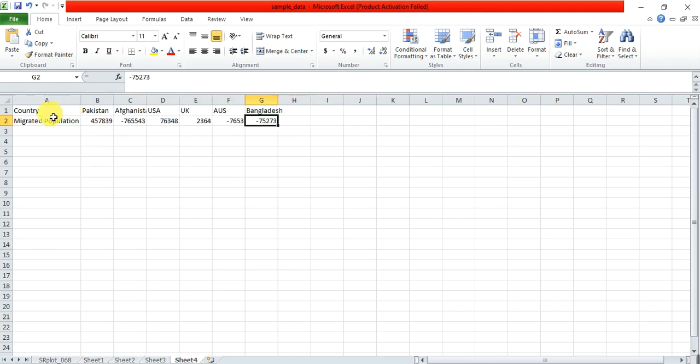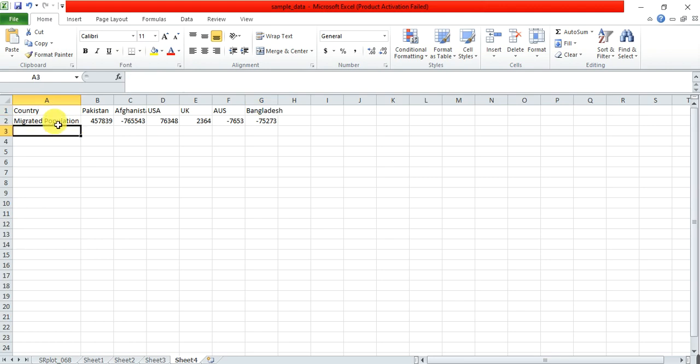And you can also use other data like population data, that how much population is migrated from any country and which one come. Like here I have the country name and the migrated population and then use that in that box and then find your graph.